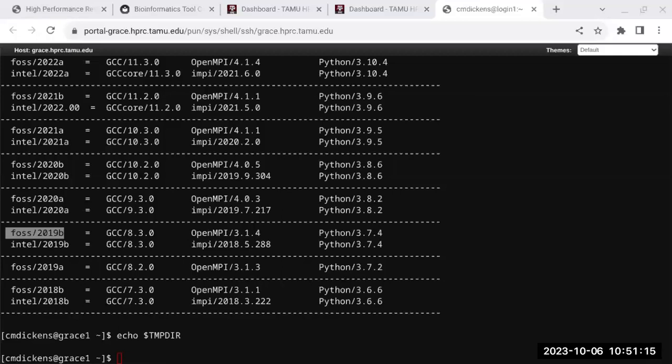quality scores. If there's any contamination, you could probably identify contaminants such as adapters, or if you actually have maybe you sequence 2 organisms. The organism you were sequencing and the person in the lab got their DNA mixed in there. You can find ways to see if you have mostly one or multiple organisms that were sequenced. That's based on GC count.